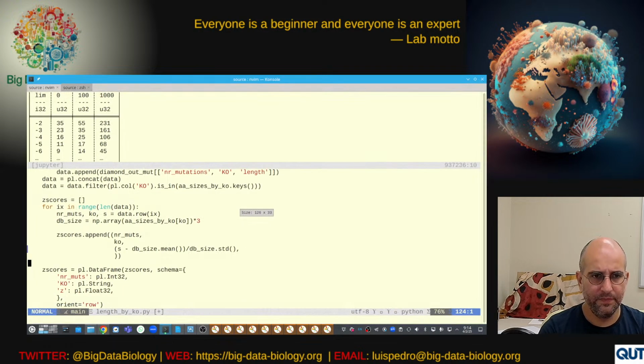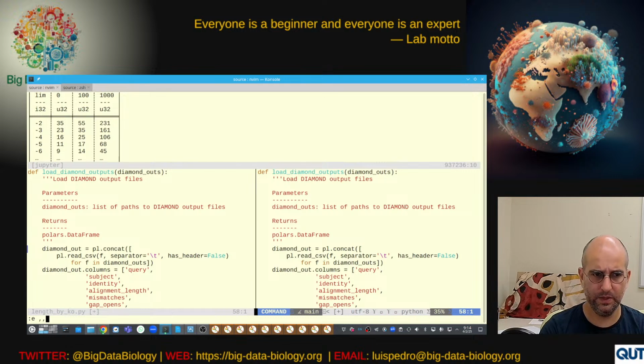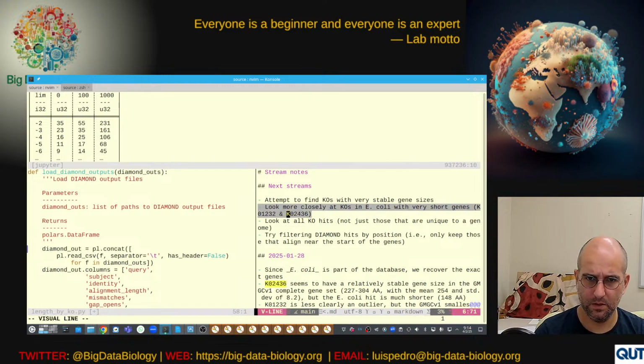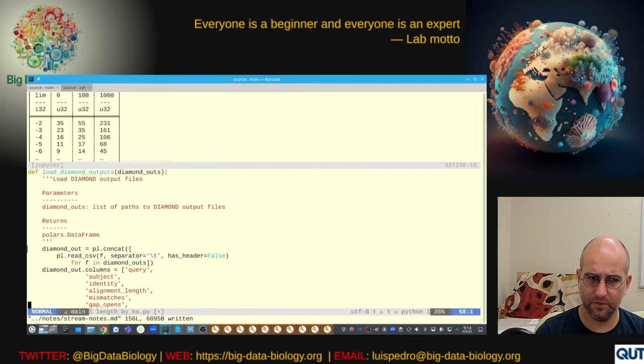Let me look at something a little bit different. So we had noticed this KO that we had looked at last week, KO 2436. Okay, this is no longer KO 2436.